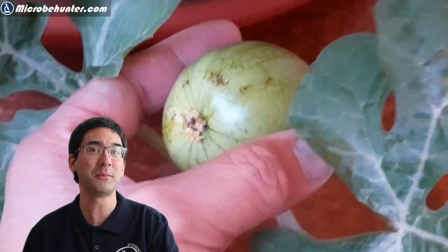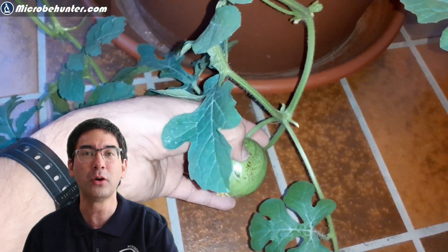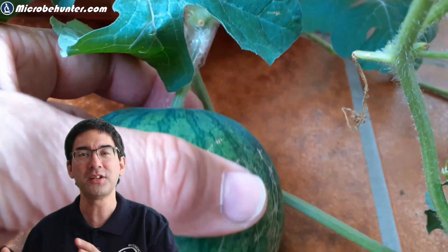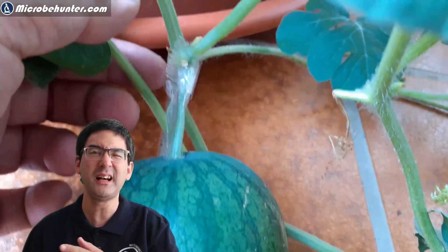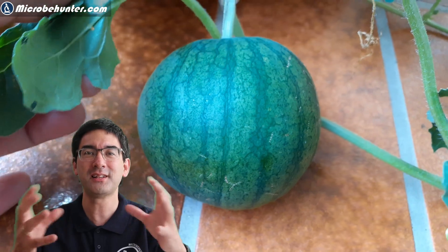I've discovered something quite interesting: the watermelon I put under the microscope was full of bacteria. I'm not saying this is a big problem, but I didn't want to eat it anymore. After a few weeks, the kids' watermelon already started to grow quite large and is starting to form those nice stripes.